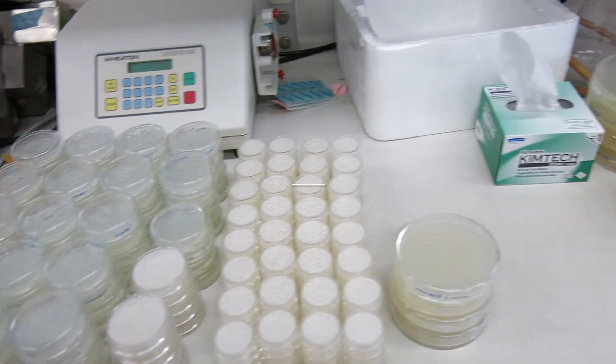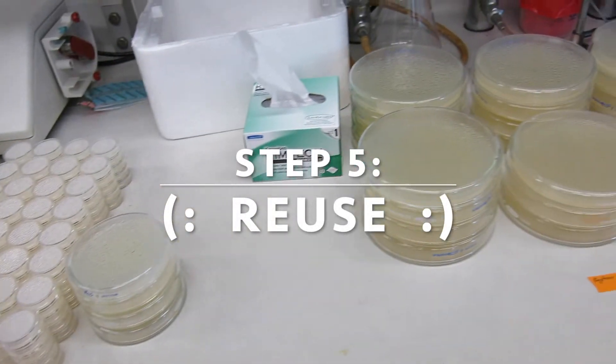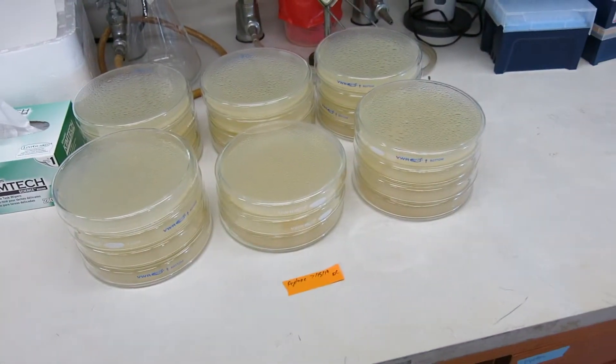Then you just make the petri dishes into new plates like normal. Now it may seem like a lot of work but it's really not that bad. You just integrate it in while you're waiting for an incubation or a centrifuge. It's a good break if you need to not think so hard for a change.